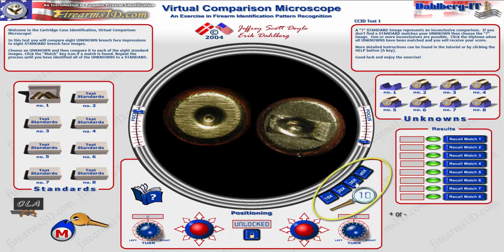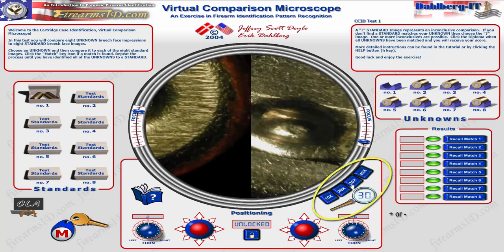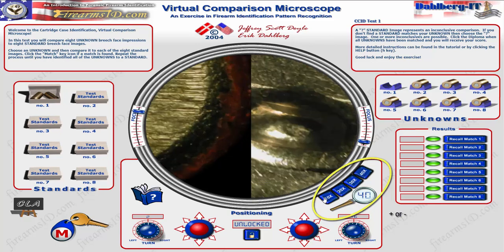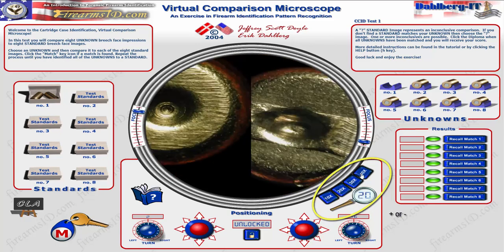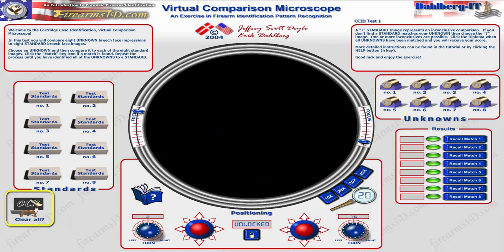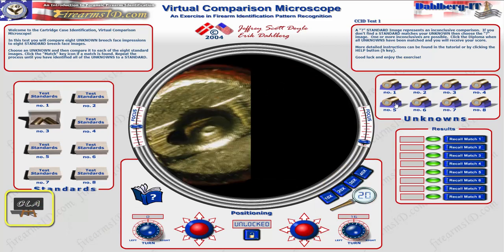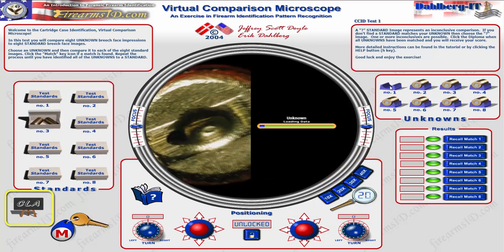The magnification options are along the side: 10x, 20x, 30x, and 40x. You can click those or use the plus and minus buttons on your keyboard to change the magnification. There's also a Clear All button if you want to wipe everything and start over.